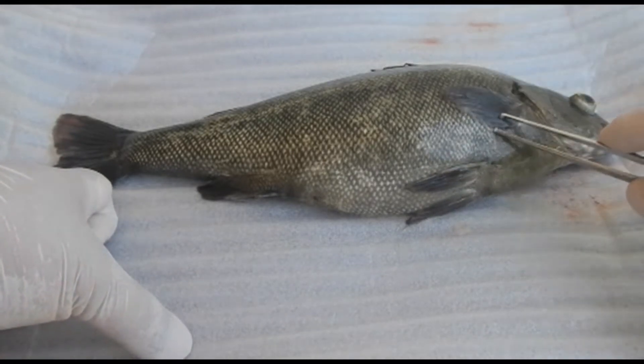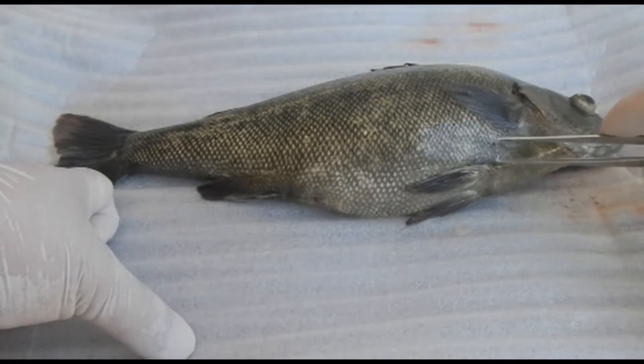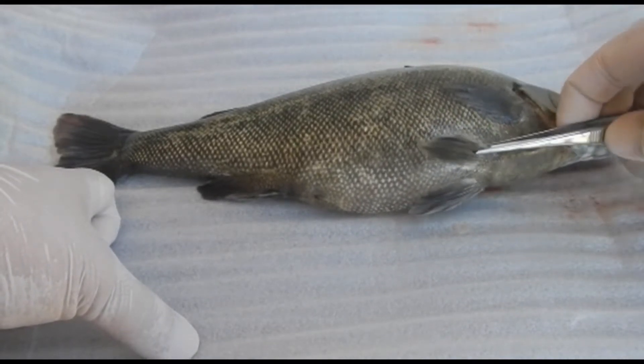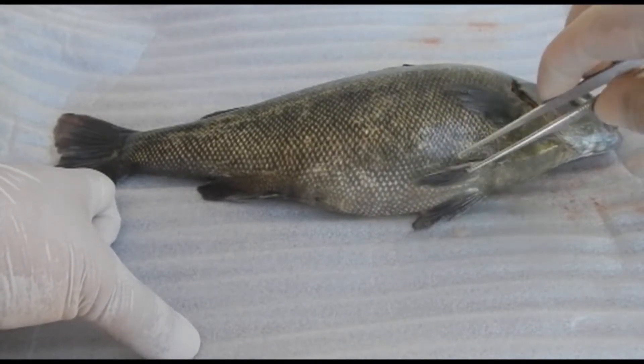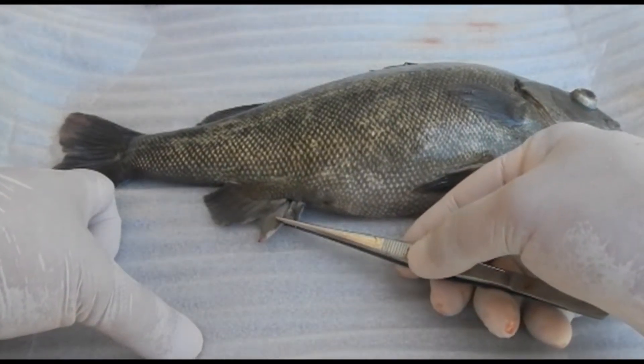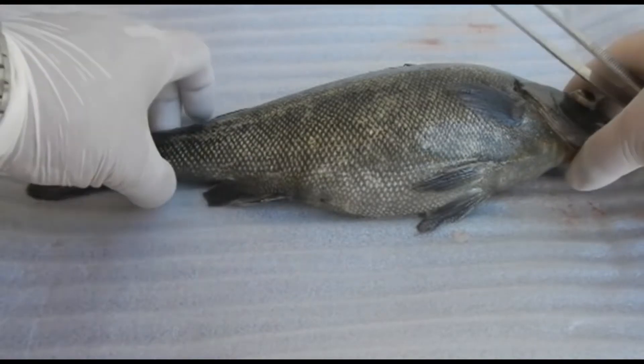Here we've got the pectoral fin, which is a paired fin that helps fish steer and also reverse. And here we have the pelvic fin, which acts as a rudder. And this is the anal fin, which is positioned near the anus.